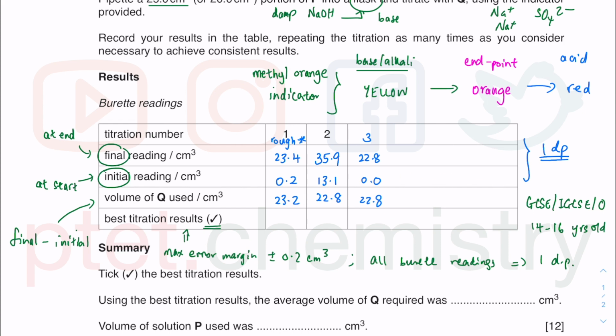You should really try to be exact from the second one and try to get a third one that is supposed to mirror what you had done, because it is you repeating your own experiment. You're using the same solution, using the same technique. They should by right come very close to each other.